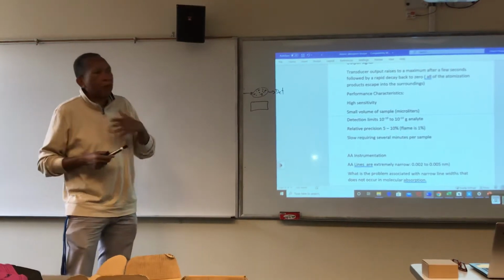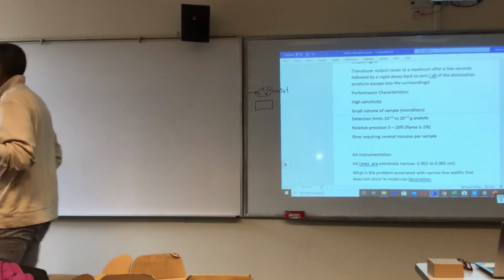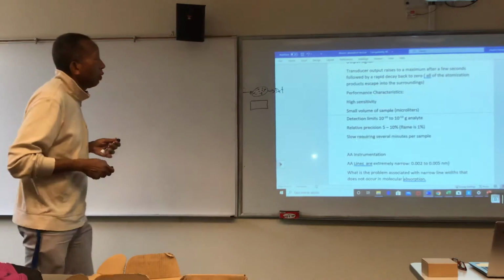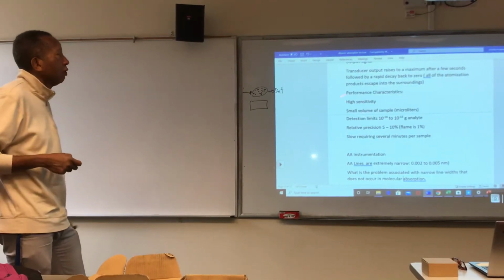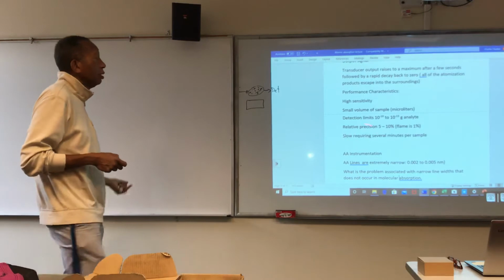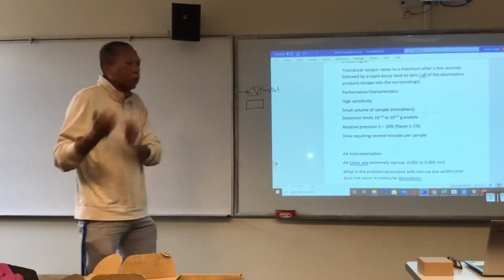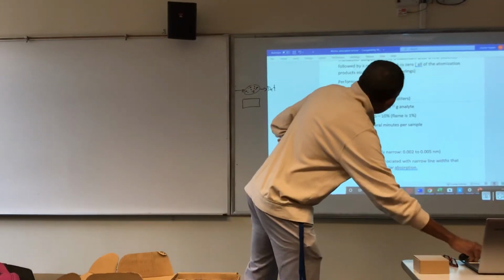In the flame, the beam is always interacting with a representative sample of the analyte, whereas here it just gets some interaction for a very small period of time. It's also slow. We have to heat the whole thing up so we can evaporate the sample, then cool it down, then put in a new sample. So that's some of the disadvantages.